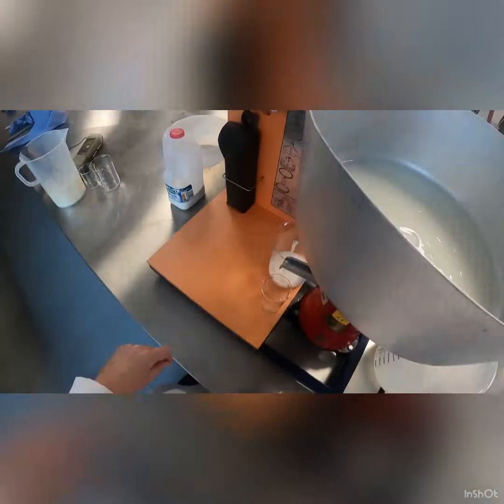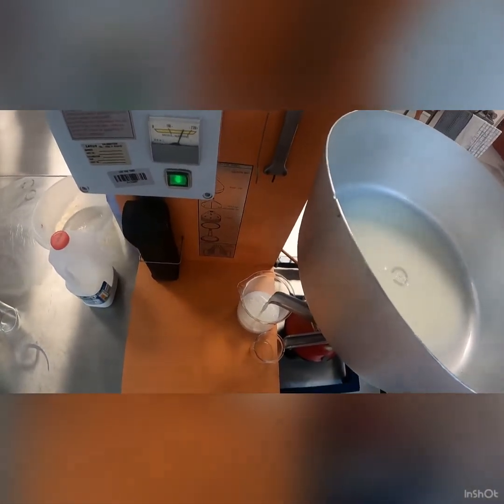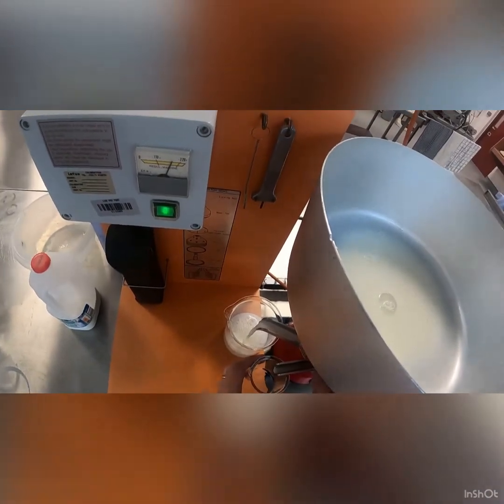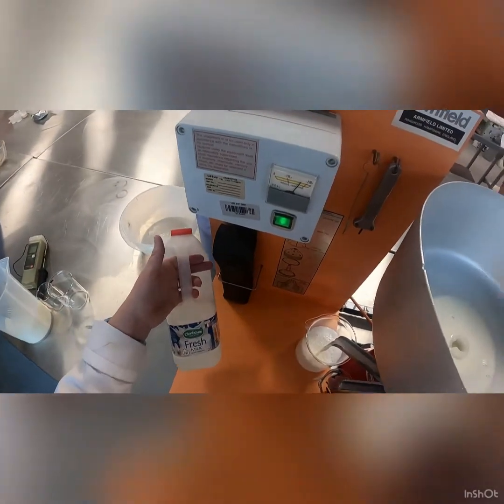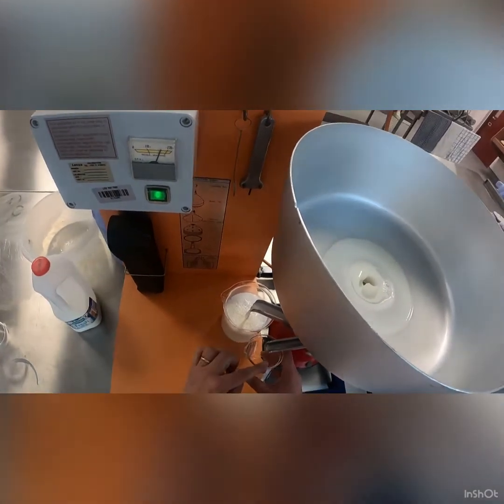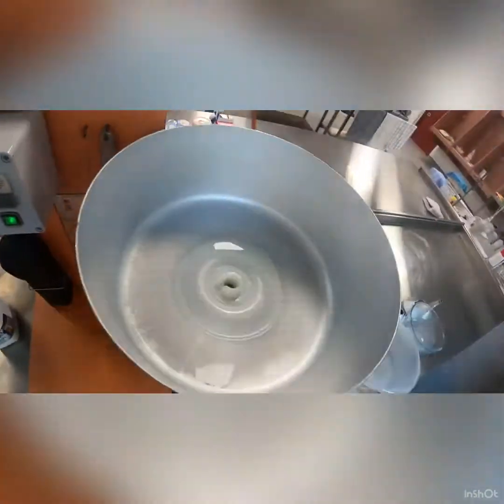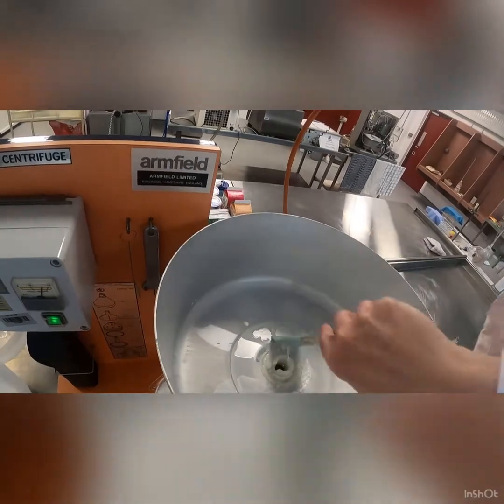Now we have a slight bit of water-milk interface — we can take that into consideration in our calculations. But you can see it's mainly all milk coming off. We don't seem to have any cream coming off at all, although this is a whole milk sample. There is absolutely no cream coming off at all.